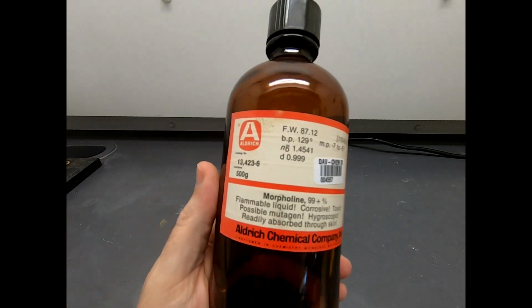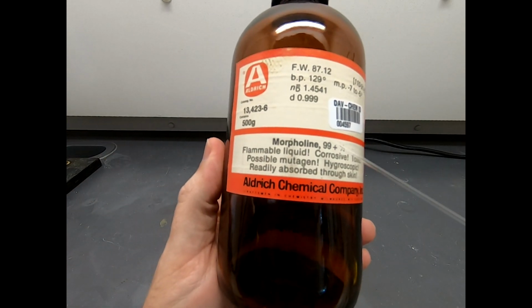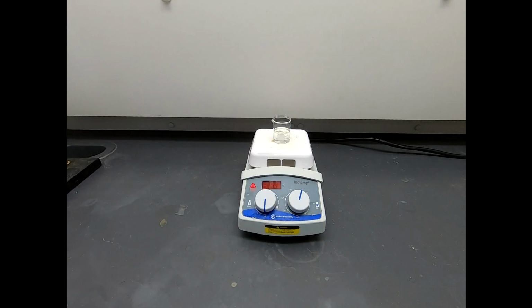Now, our amine, you can see another very old bottle. This is morpholine. The procedure I'm following actually calls for piperidine, but I couldn't find piperidine in my lab, and I found some morpholine, which is structurally very similar. So I think I'm just going to go with this.